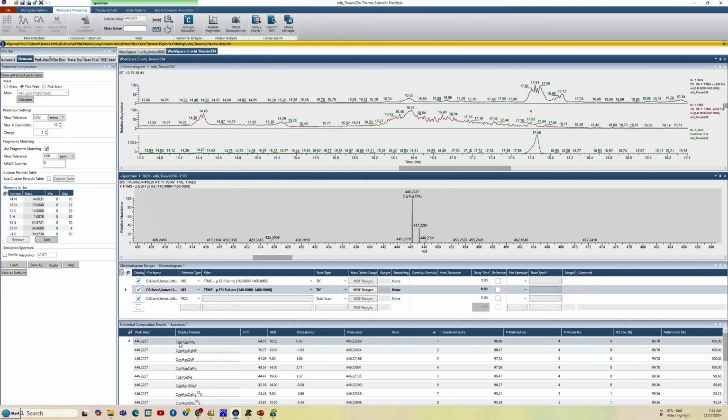And again, C30H28ON3. So this is minus a hydrogen. So it'd actually be H29 for the species. A good fit. Very small difference in the millimass units, even for this very small overall signal. And you can see the theoretical mass versus the accurate mass looks very good. Only a small difference. Look at the isotope ratios. The number of isotopes matched were 4.